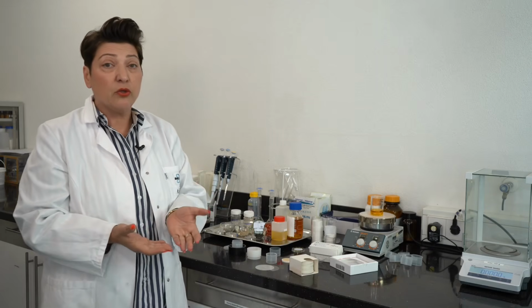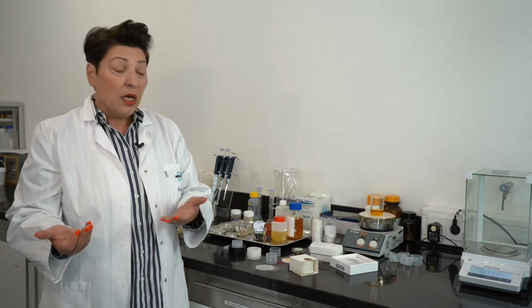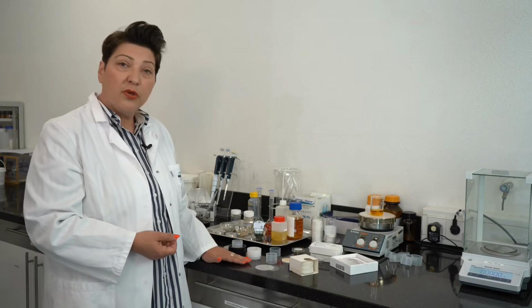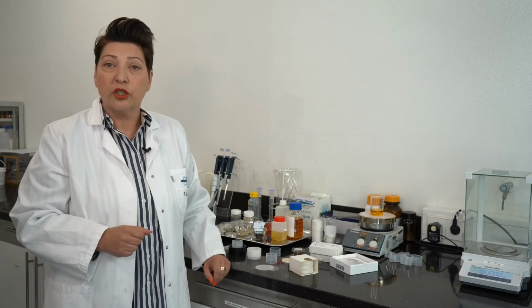What is also important, you have to think about the chemical resistance of the foil, especially if you have some acid samples or maybe some gasoline-based samples. Then you have to use different kinds of foils. You can test it easily if you pour the sample into the cup. You just keep it on a tissue for a few minutes. If you do not see any leakage on the tissue, you can use it.